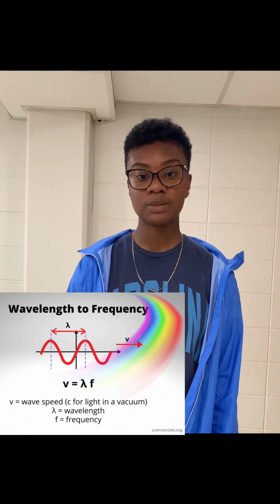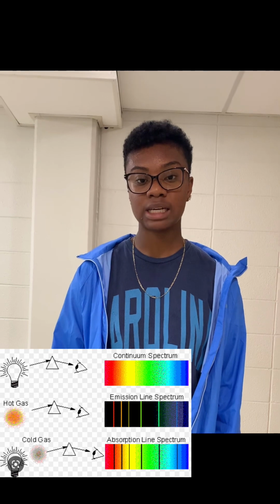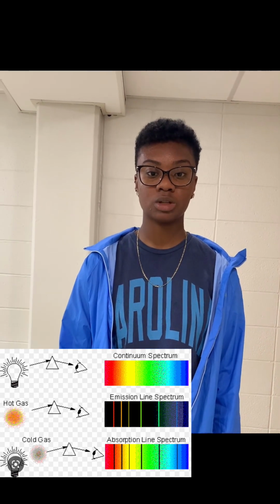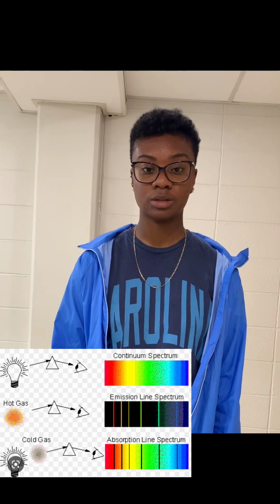The usefulness of the spectroscope comes with considering the types of light emitted by different elements. Each element, when caused to emit light, emits a signature spectrum, a set of wavelengths specific to that element alone. The spectroscope has been crucial in determining the types and concentrations of elements present in the solar system and the whole universe.